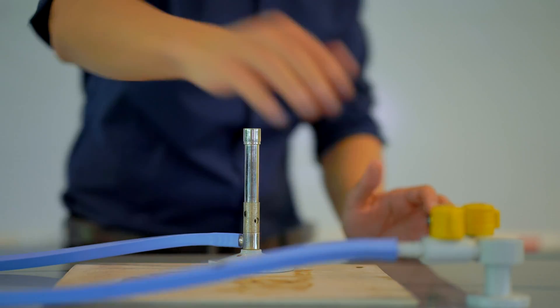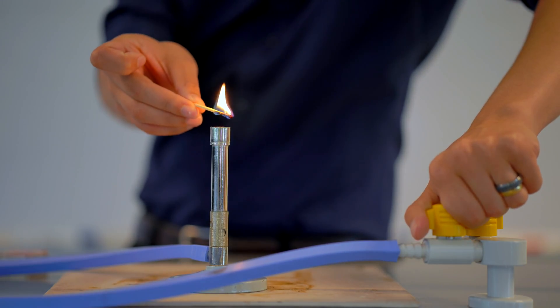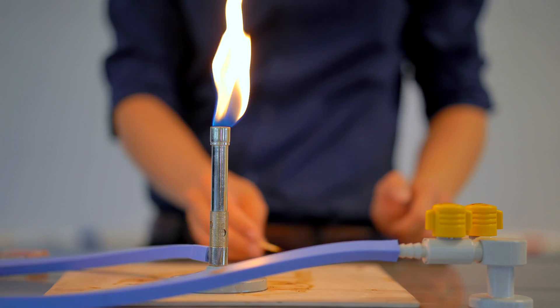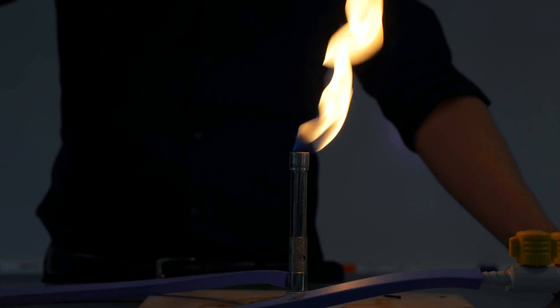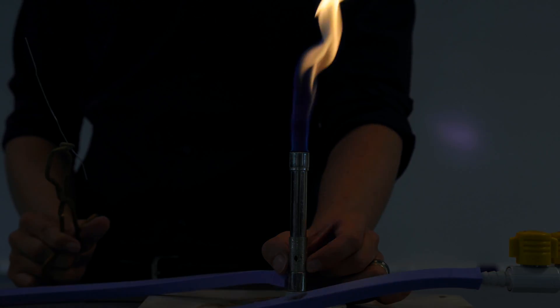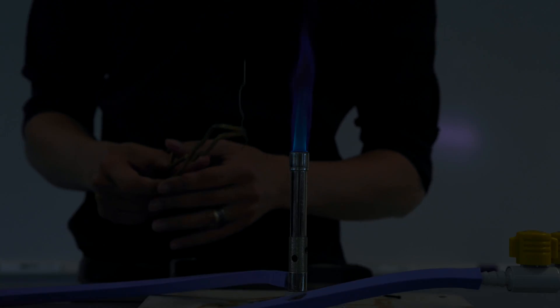Here I've got an ordinary paper clip — I tried to find the biggest one I could. I want you to make a prediction: if I put this into the hot flame, will this piece of wire chemically change? The students reckon no, so let's put it to the test anyway.